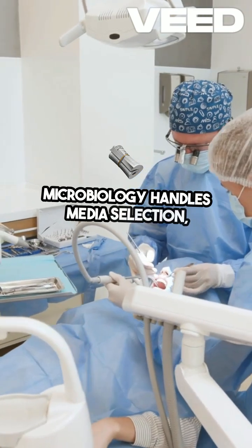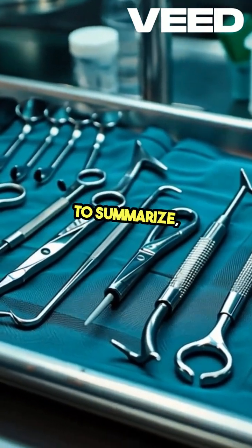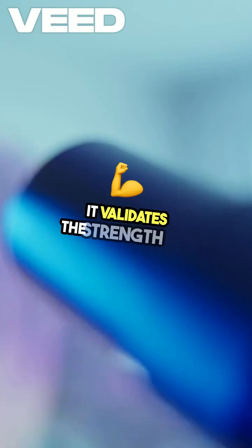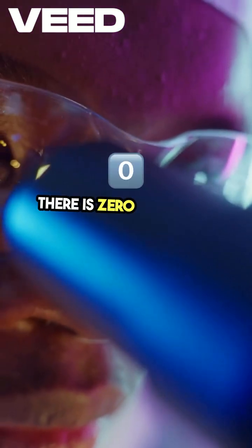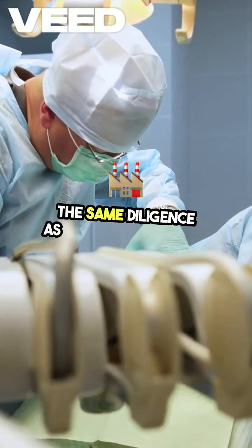Microbiology handles media selection, environmental monitoring, incubation management, and growth assessments. To summarize, media fill is the backbone of sterile manufacturing assurance. It validates the strength and reliability of our aseptic processes. There is 0 tolerance for contamination. And every operator must approach a media fill run with the same diligence as actual production.